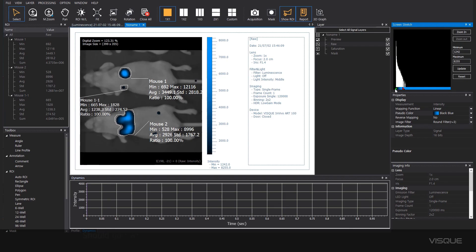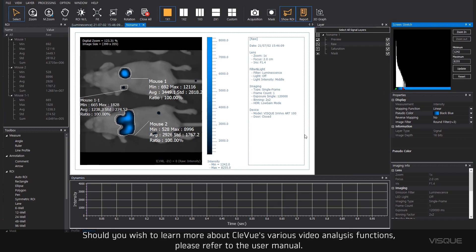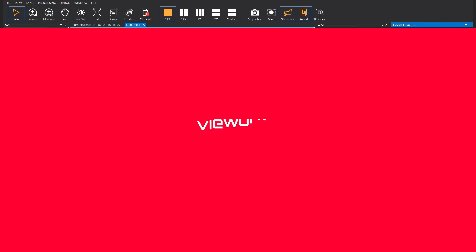If you wish to learn more about CleVue's various video analysis functions, please refer to the user manual.